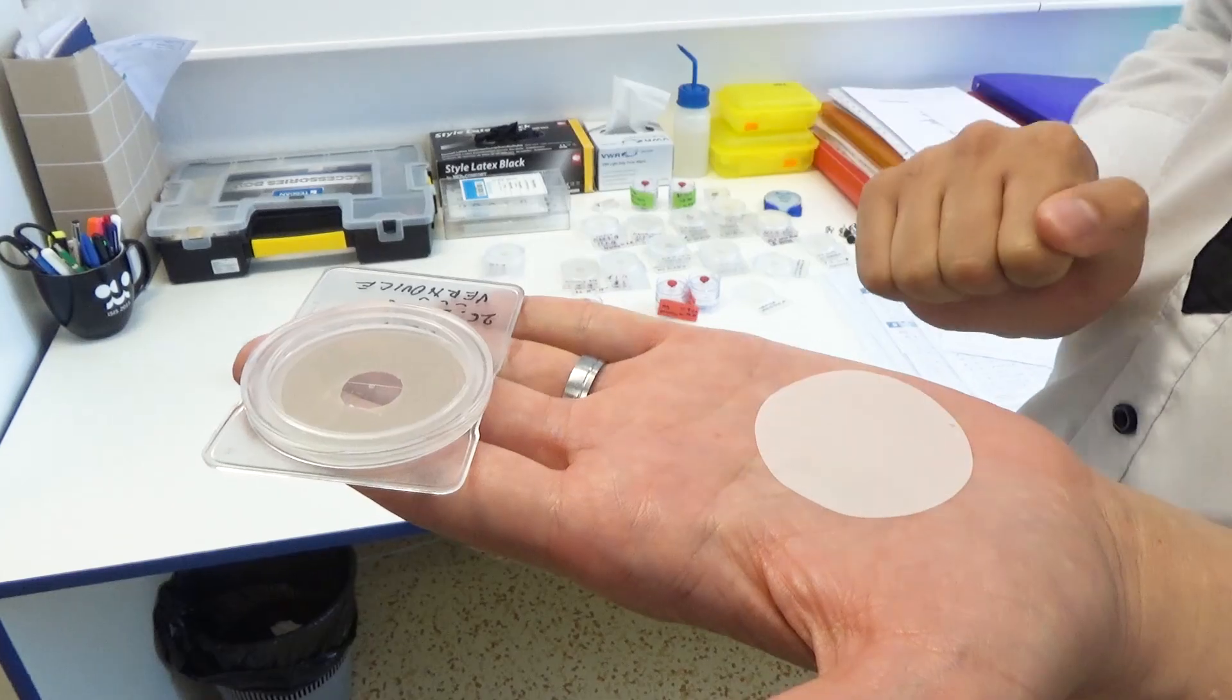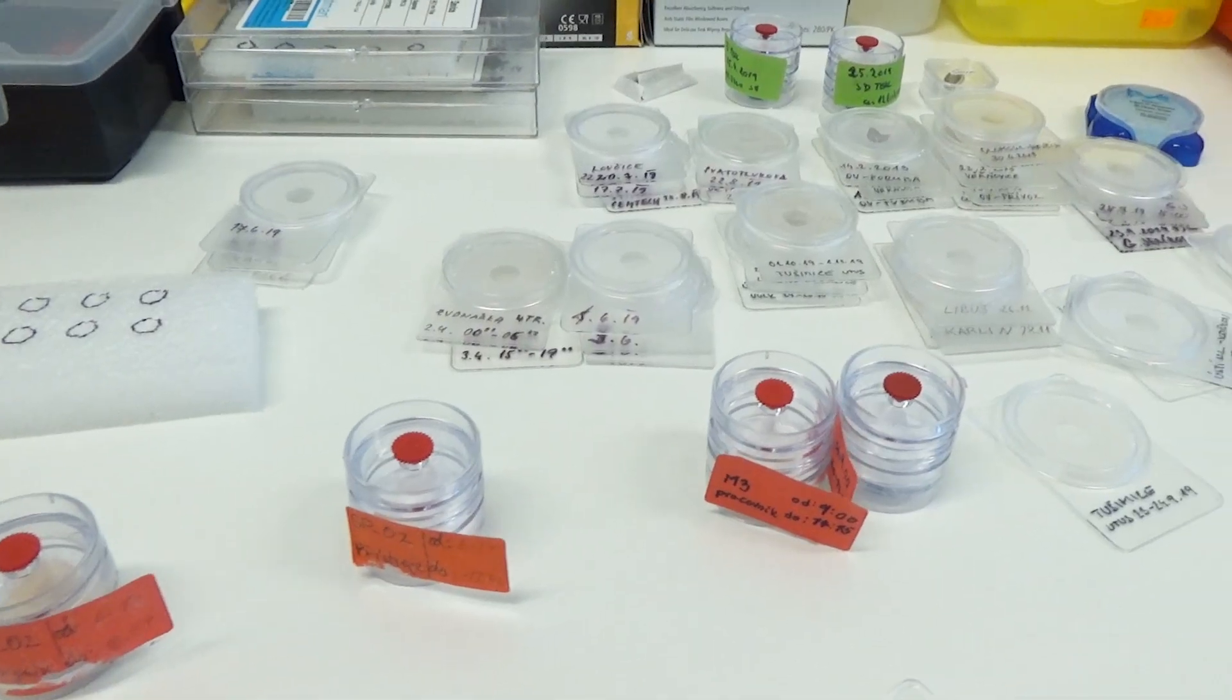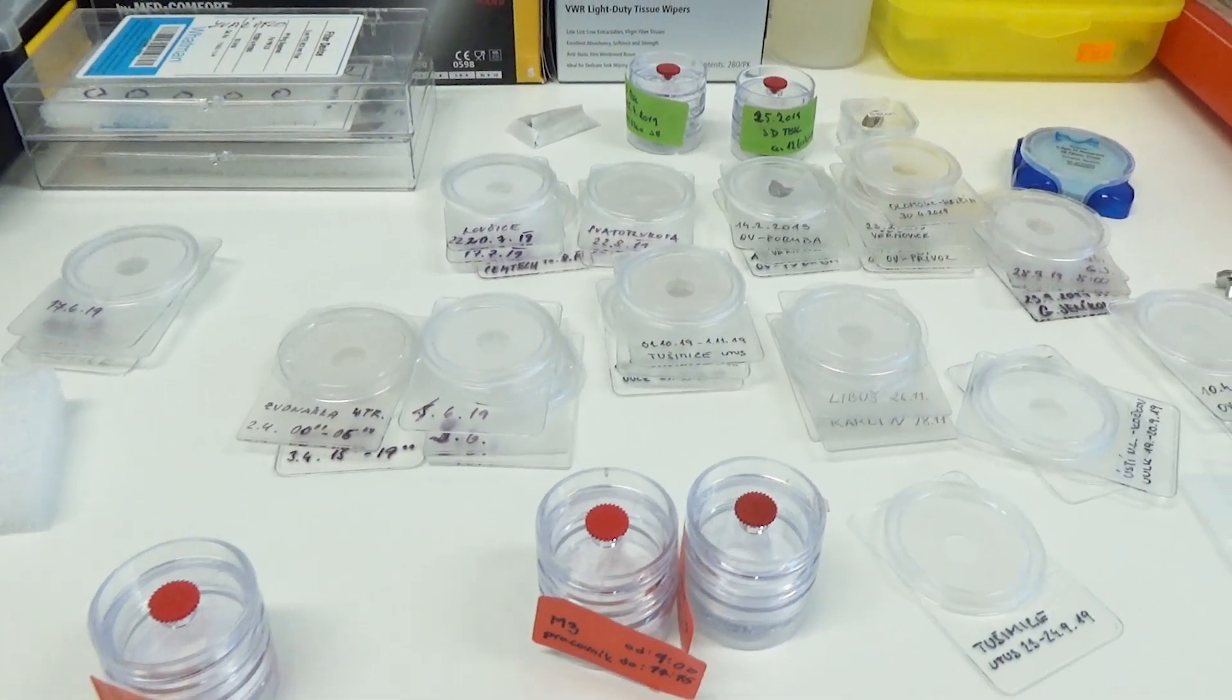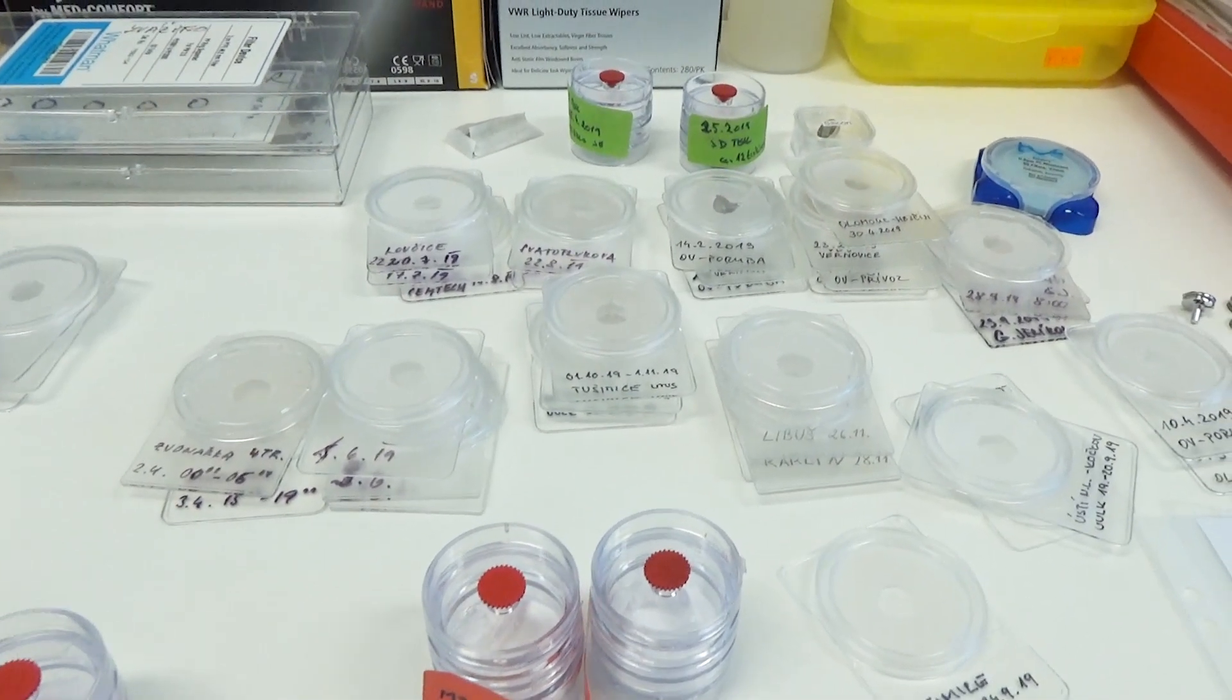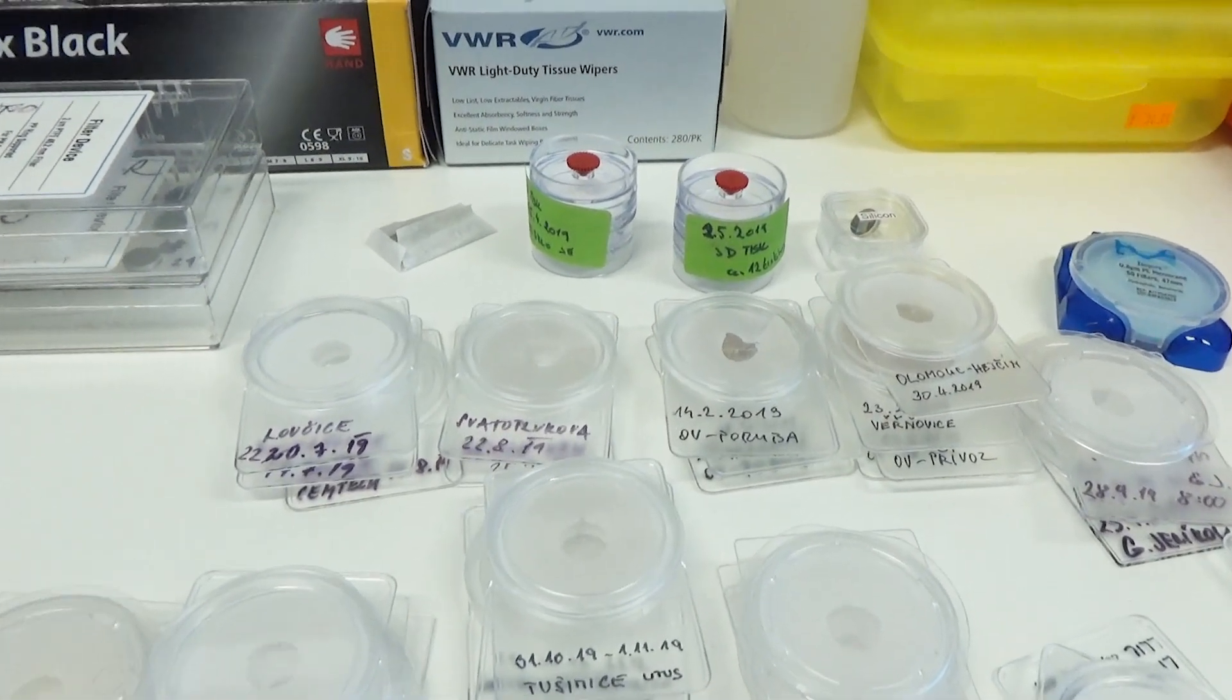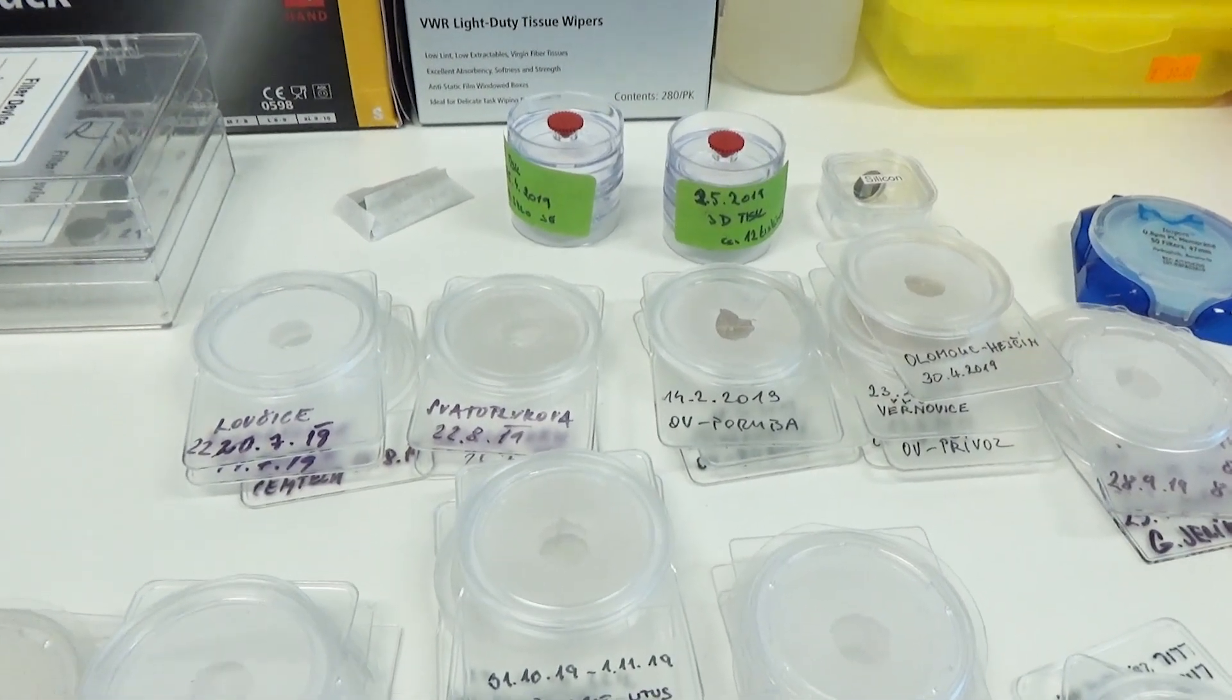This way we can determine concentrations of heavy metals or other carcinogenic compounds, or use the filter for further analysis in different ways.